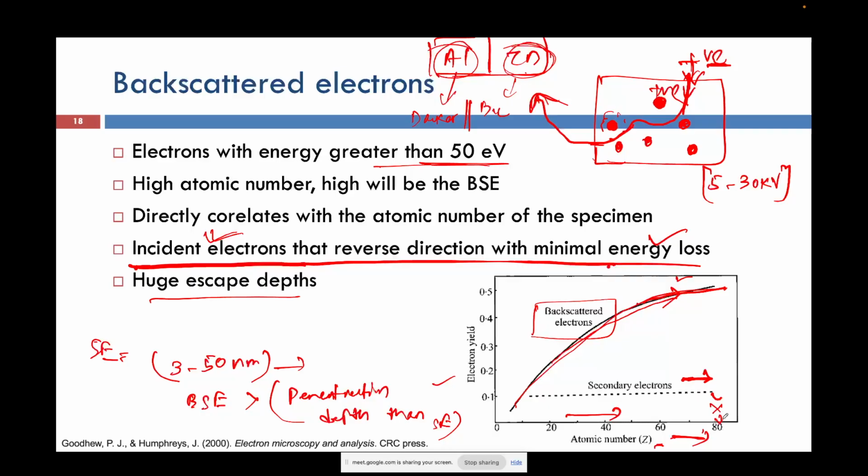I have one more query. Yes, please. We see a lot of reports with SEM images and also EDAX analysis. In EDAX analysis we can see the count and the intensity. Now I want to understand how much count should be there, whether there is a standard process or some guidelines. Metallurgy is a beautiful subject; if you give it to 4 labs, they will do the same thing in 4 different ways. Someone does 1,000 counts, someone does 5,000 counts. It depends. Yeah, I get it.